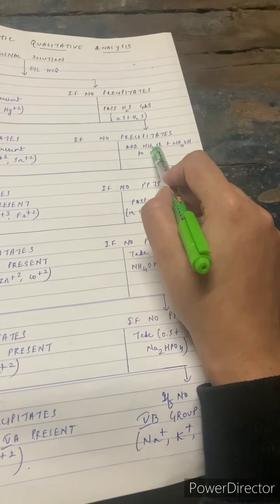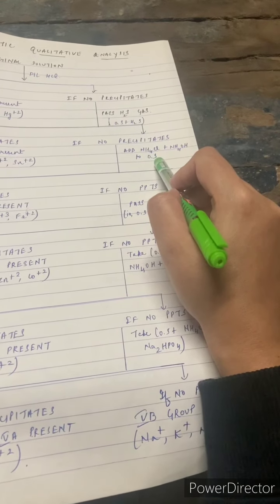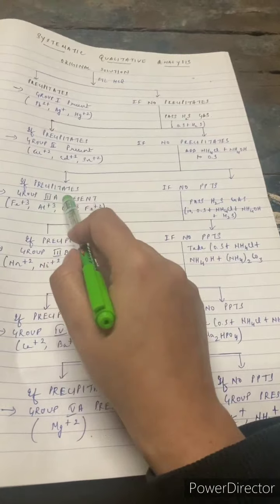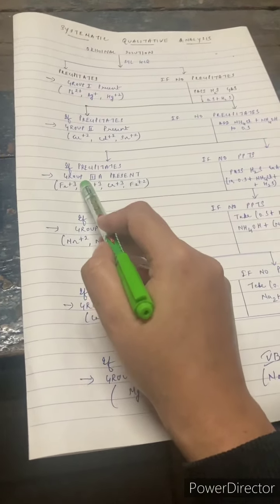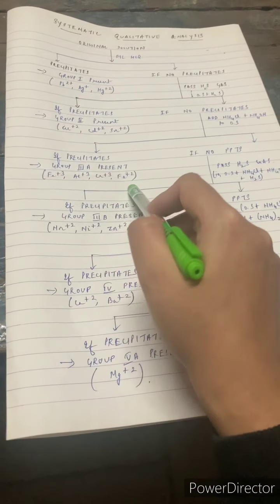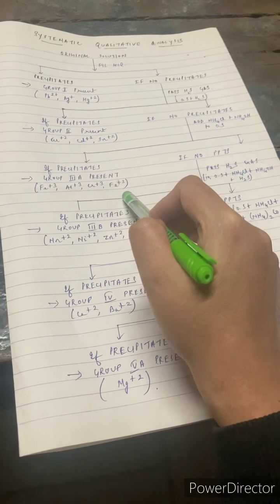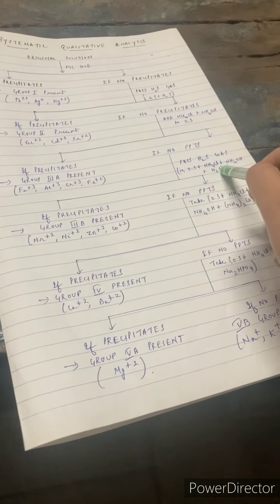I'll add ammonium chloride plus ammonium hydroxide to my OS, and again I'll check if precipitates are coming or not. If precipitates are coming, I'll say that group 3A is present. These are the ions present in group 3A: ferric, aluminium, chromium and ferrous ion. Again, if no precipitates are there, I'll pass to my next step.